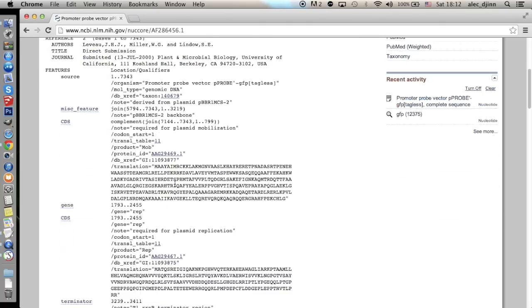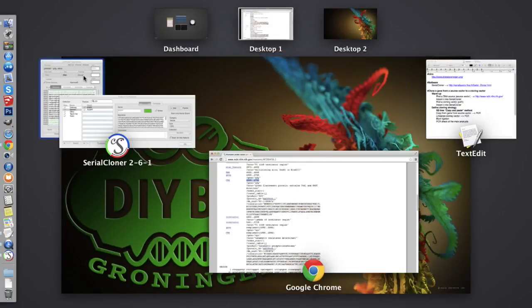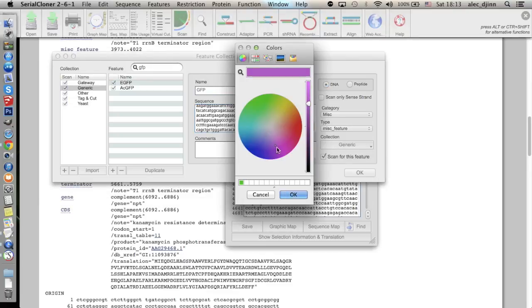First of all, we need to locate the exact sequence that codes for GFP. This information can be found on the NCBI web page we have loaded in the browser. We can see the protein sequence of GFP, but what we are looking for is the genetic code. This line gives the position in the sequence where we can find it. We input these numbers into the text box in the sequence window in Serial Cloner, and hitting enter selects the sequence between those indices. The sequence starts with an ATG codon — a classic methionine start codon. Now let's copy the selected sequence and add a new entry feature by clicking the plus button. We insert the name of the feature, GFP, paste its sequence, and assign it a color — let's pick purple — so we can spot it easily.